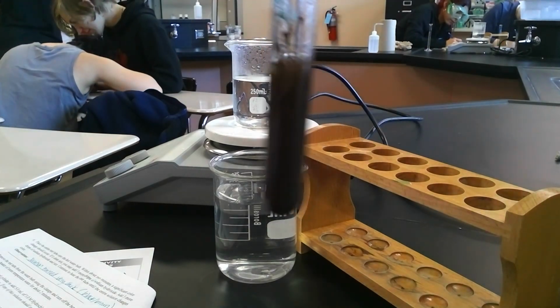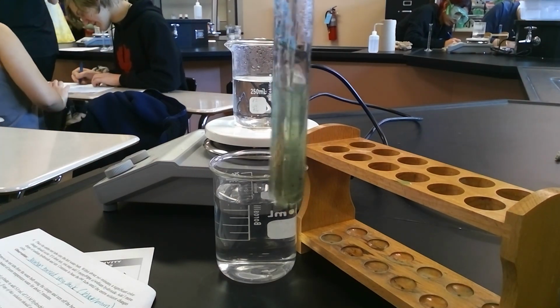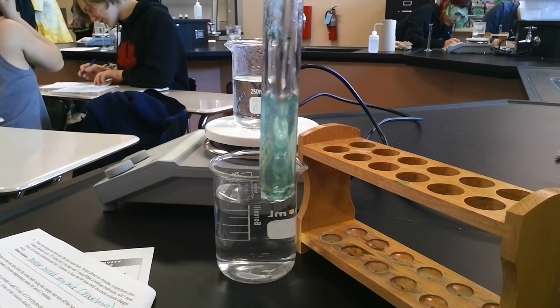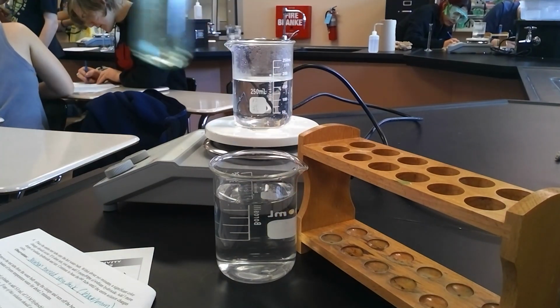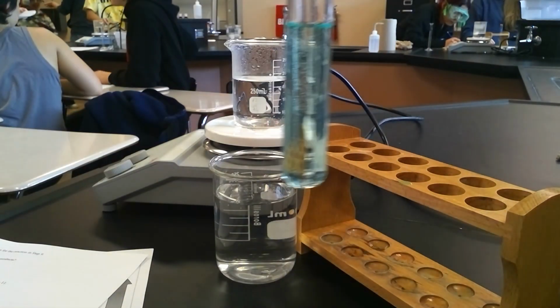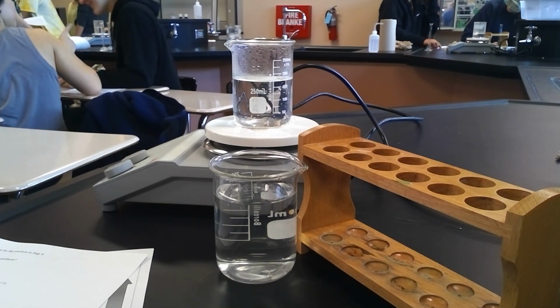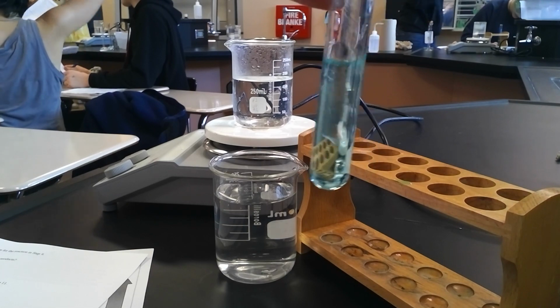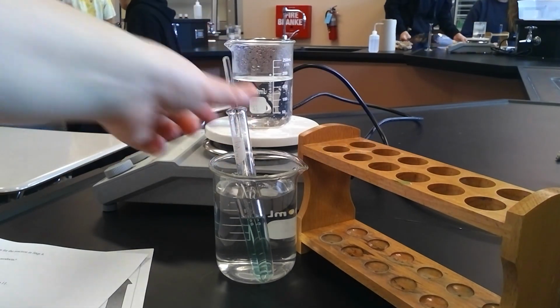into my test tube and continue to swirl, mix, swirl, mix, swirl, and literally right before your eyes, you can see a dramatic difference in this. So this is where we have created our copper 2 chloride and water. So it's basically just watered down copper 2 chloride or diluted copper 2 chloride. This is an acid-base reaction, so we put acid into it, and then it ends up breaking down into water and something else.